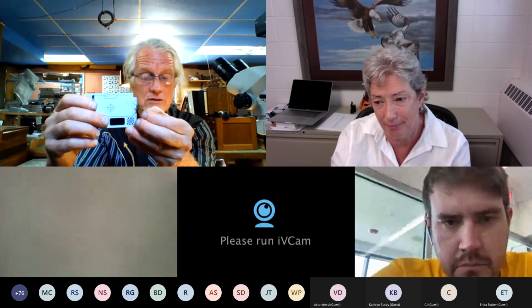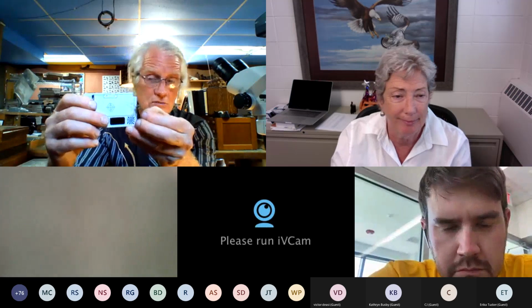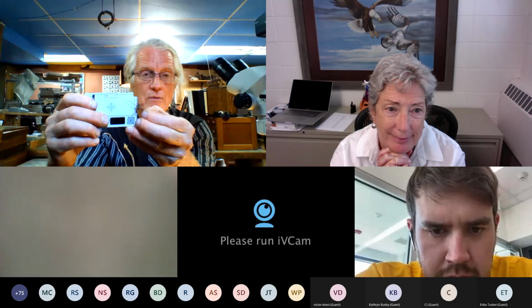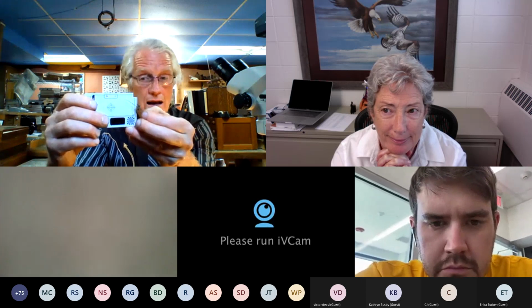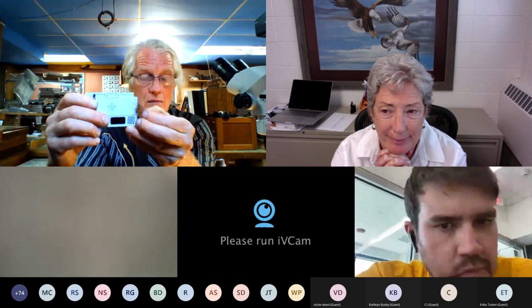And then in my mind, I'll say, okay, the abdomen's curled, I'm going to add another millimeter or 2 more millimeters. And then that'll be my best guess as to what the size of this bee is. But because it's in the guessing framework, I'm also going to bump that guess up 1 and down 1. So if my best guess is 11 millimeters, I'm going to do 10, 11, 12 in the guide to bracket my answer, even though the guide has also bracketed its answers to be broad.